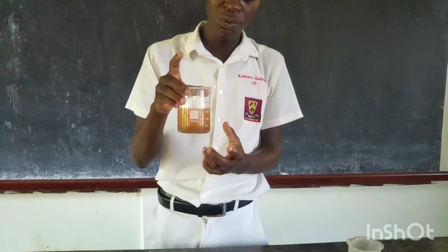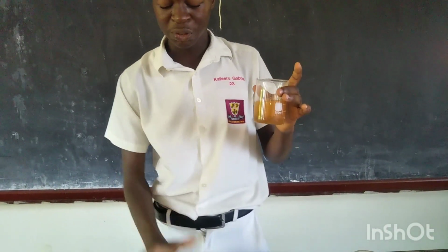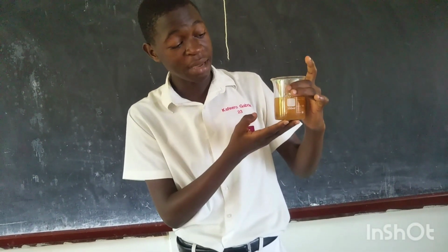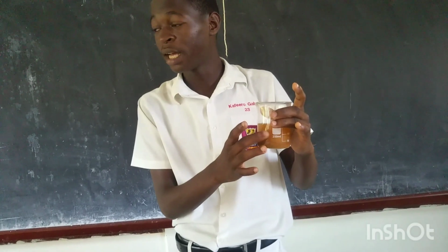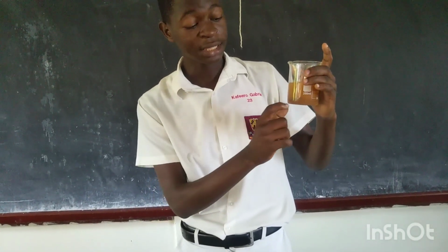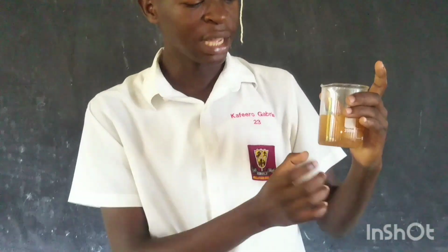So what I need to do is just get this water and pour it into my empty beaker, as my rules say, of separating the sand from water. I get here my empty beaker. As I told you, there are some layers formed here, as you see on the beaker, after separating these two things and giving it time to decant.